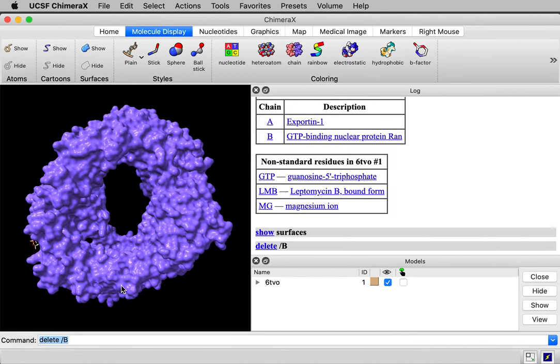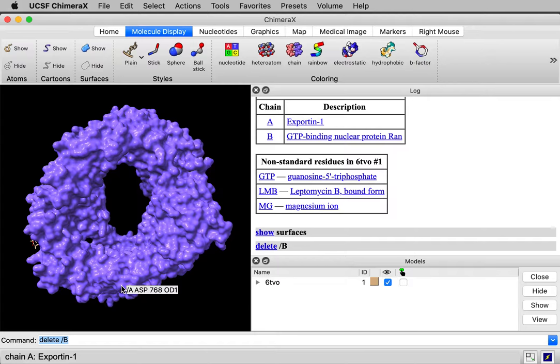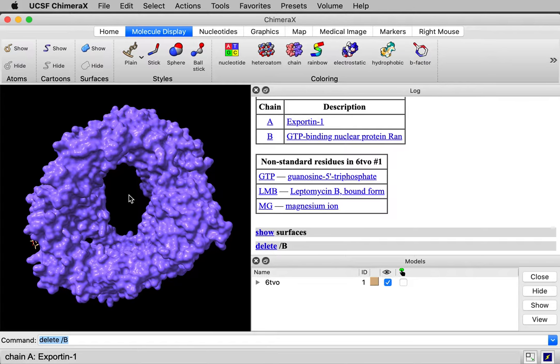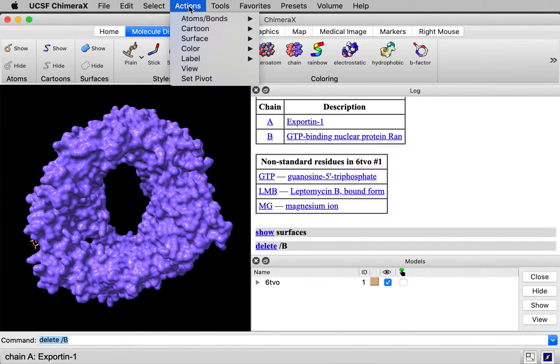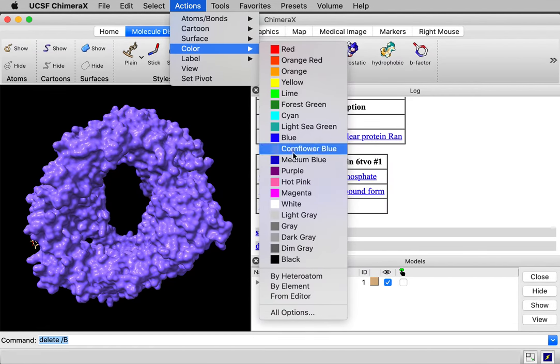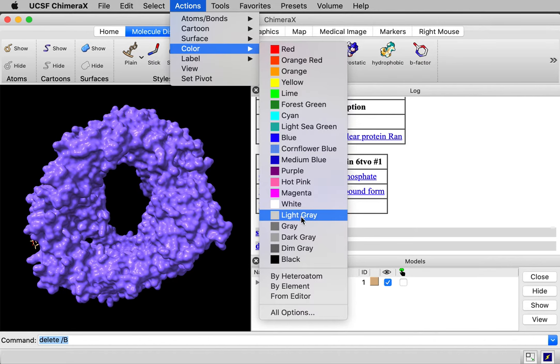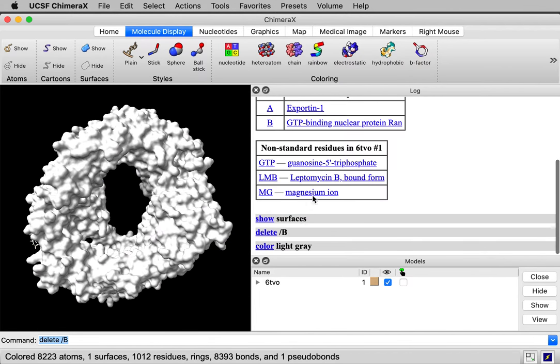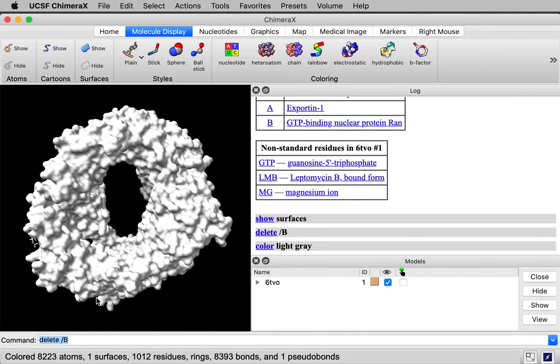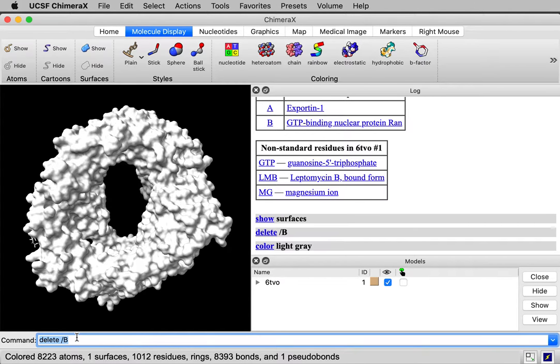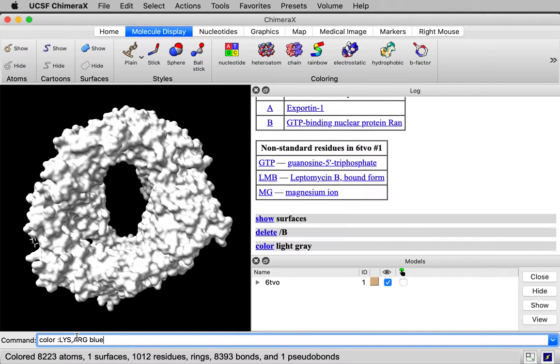Let's take a look now at three ways to do this electrostatic coloring. The first is the simplest. We're going to just color negative charged residues red, positive charged residues blue. First I'm going to color the whole surface white. Actually, I think I'll choose light gray. Then I'm going to type a command, say color the positive residues, lysine and arginine blue.